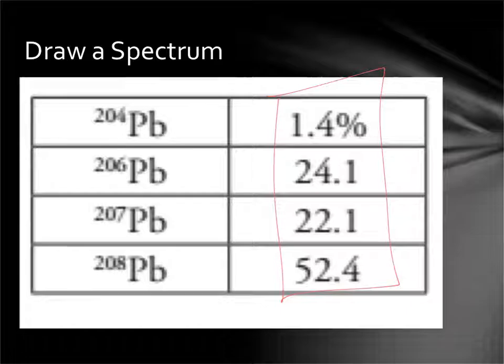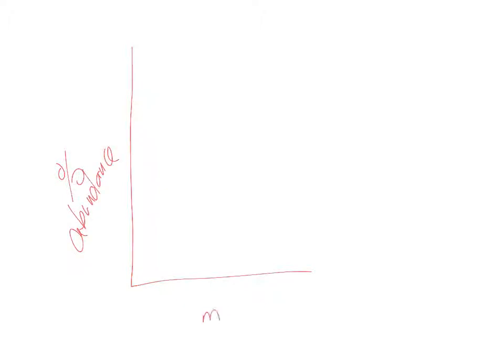All right, so our axes of our graph should be percent abundance over here, and then our mass-charge ratio down here. Now we want our percent abundance to run to 100, and then there's 50, right? That's our middle.